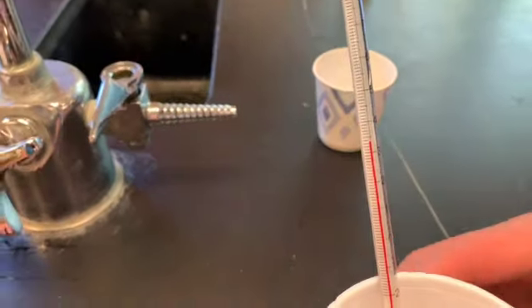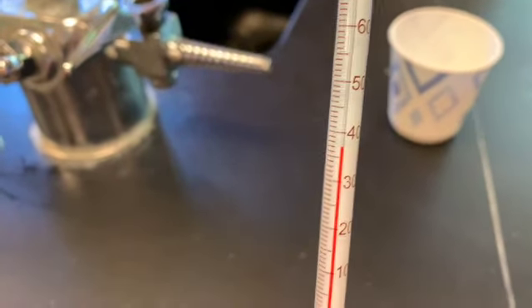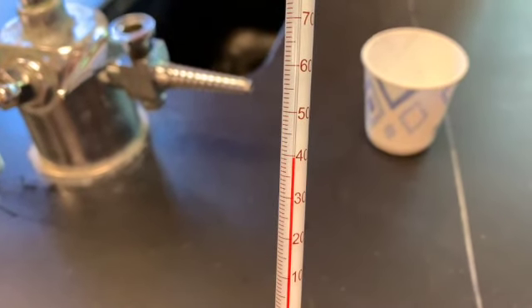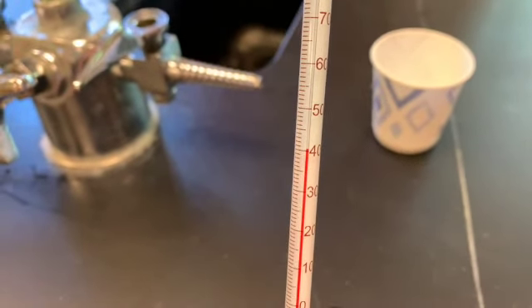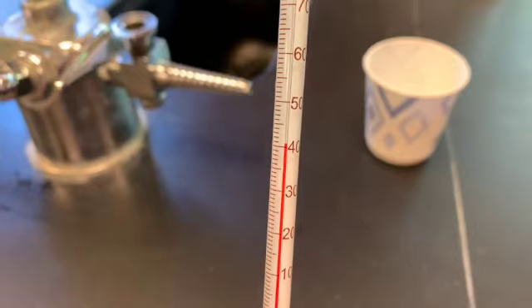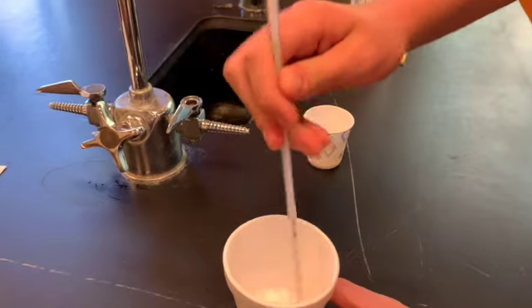Is that good? Yeah. Cool. All right. We can look inside. Not a whole lot to look at, but our temperature is definitely going up. Let's try and get that in focus. There we go. Temperature is definitely going up. And we're just going to wait and see how high that temperature gets. Yeah, that's looking good. It's getting clearer and clearer. And we're looking for our highest temperature here. Okay, we just want to give it one more stir. Make sure it's all reacted.